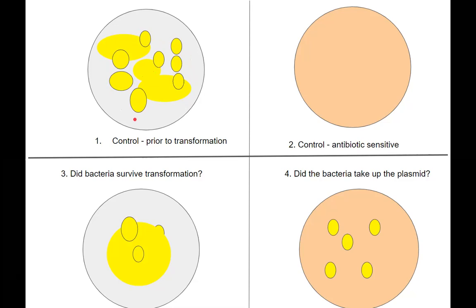Then we're going to go in and check to make sure that whatever it is that the bacteria is doing, we're going to have a way to check before and after, did it change? So in this example, we're going to be looking at antibiotic resistance. So this plate is a different color because the agar also has an antibiotic. Now, if this is normal bacteria, then no colonies should appear on this antibiotic plate.